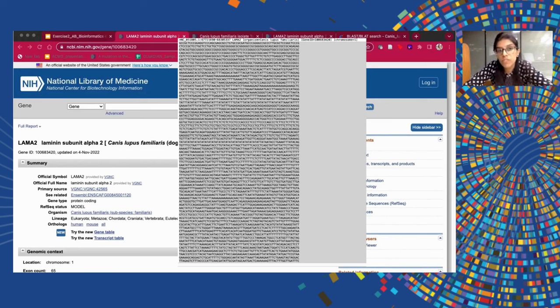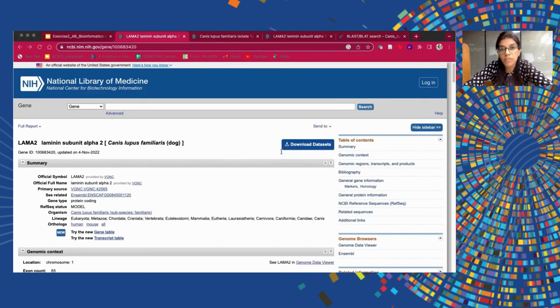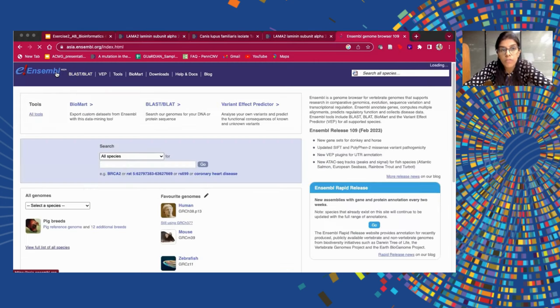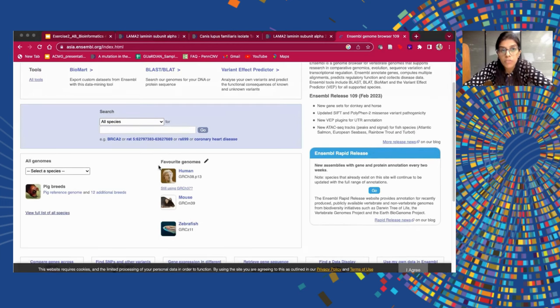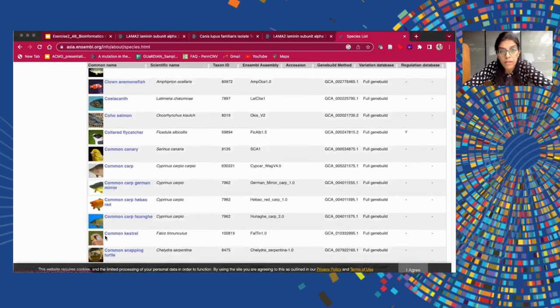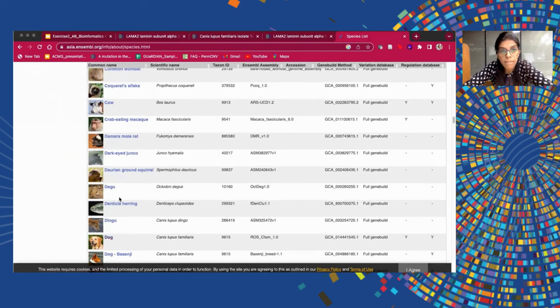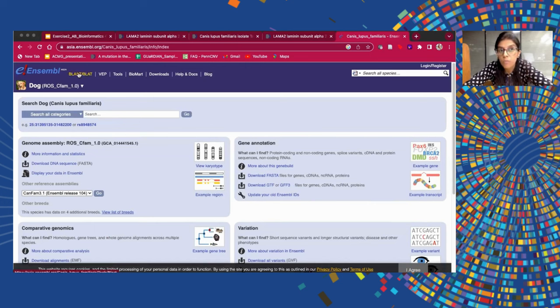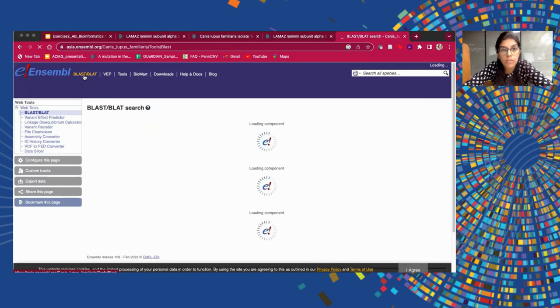Since we already know this is the LAMA2 gene sequence we downloaded, it will be a good exercise to confirm we come back to the same gene. I have already copied a section of the gene. This is the BLAST or the BLAT Ensembl page that we will be using. Here there are multiple genomes present, so we need to first select the genome we are working on — the dog's genome. The top corner of the Ensembl webpage has an option known as BLAST or BLAT, which we need to click.